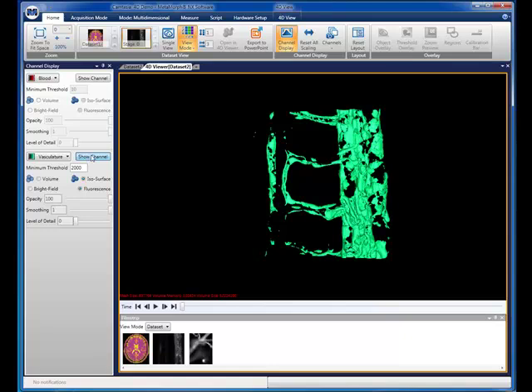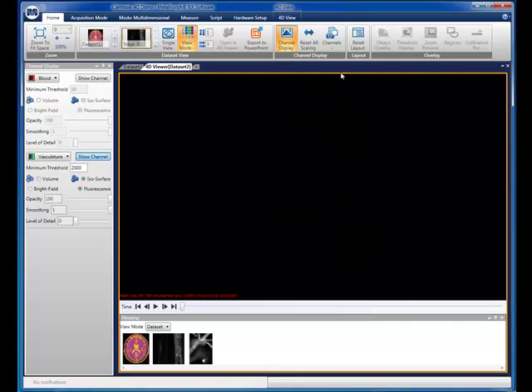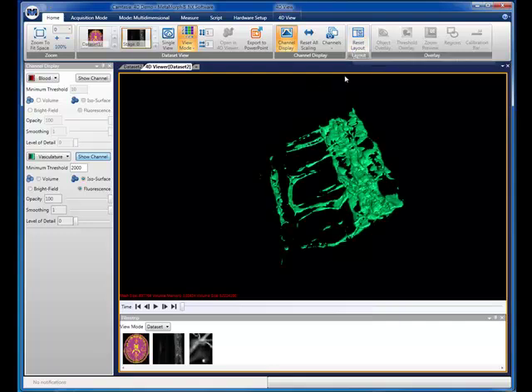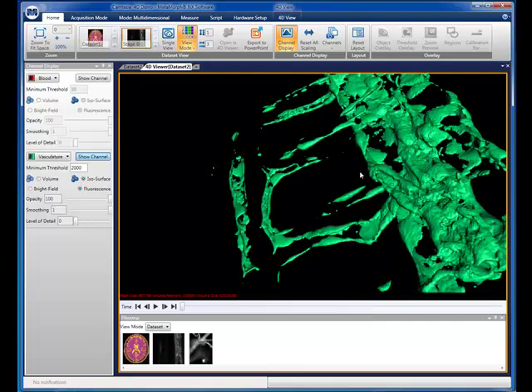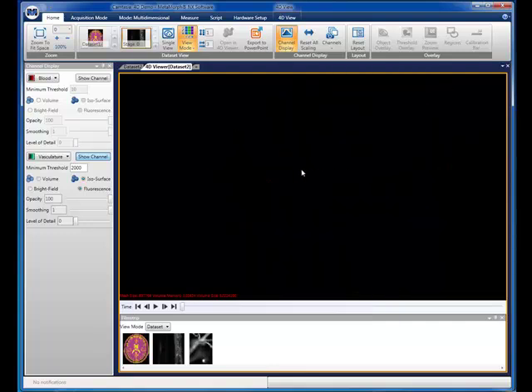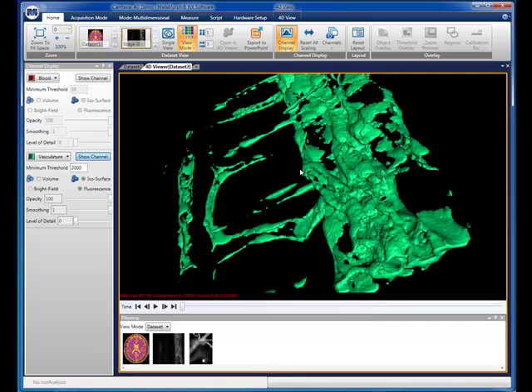Once rendered, you can zoom, pan, and rotate the image with the mouse. Holding the left mouse button lets you rotate. Scrolling with the mouse wheel lets you zoom in and out. Holding the center button while dragging lets you pan the image. As you can see, when I rotate the image, only a sparse data set is presented. This makes moving the image more responsive by not having to render the 3D image with every movement.